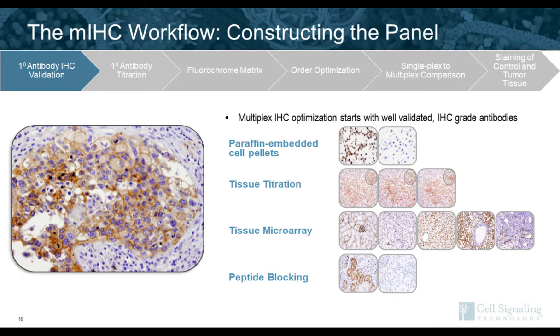And then we'll finish up with either peptide blocking to just do a final level of validation, or for our phospho-specific antibodies, we'll do a lambda phosphatase treatment to prove that they're, in fact, binding to the phosphorylated protein.